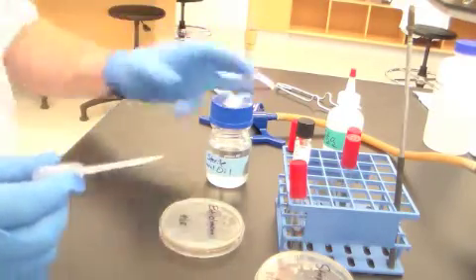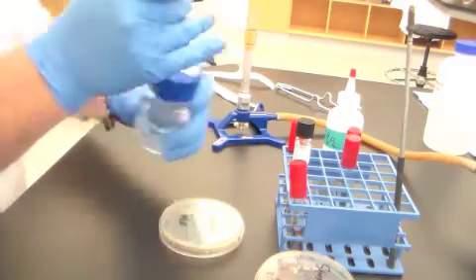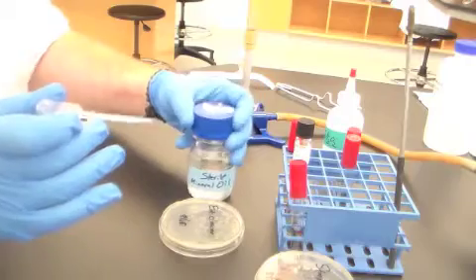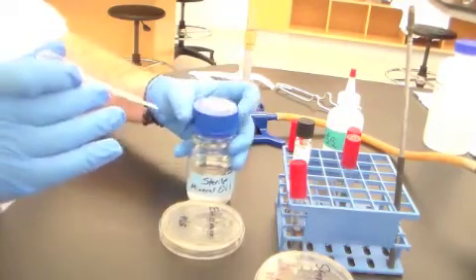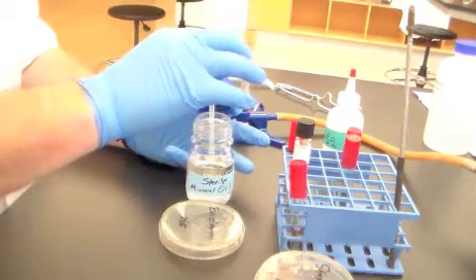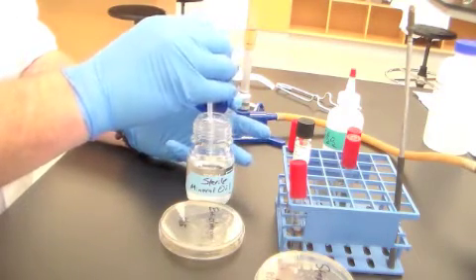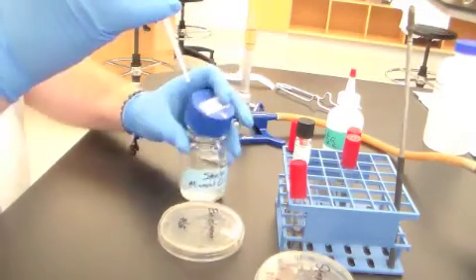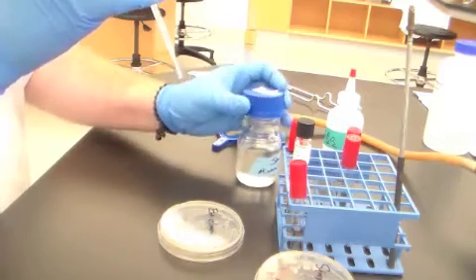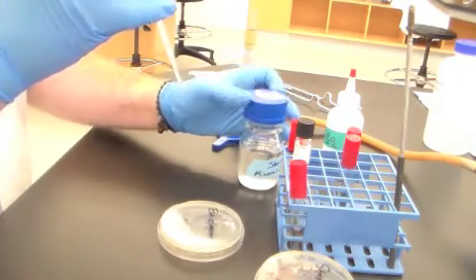So what I'm going to do, and you're going to do, I should crack that open before the video started. I'm going to take sterile mineral oil, pull some up into this sterile Pasteur pipette. You can tell I'm right-handed, I can't really do much with my left hand.